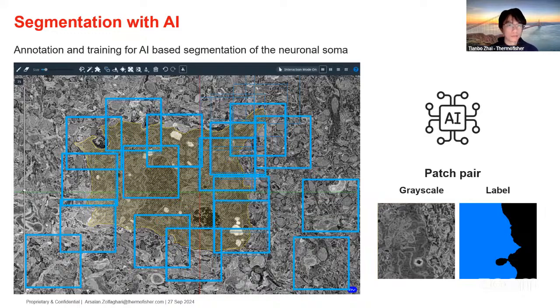Again, during the image analysis or segmentation in particular here, if you could try to view it down to the pixel or voxel level, then you will find many of the algorithms, or even the deep learning technique, make more sense. Going back to the prediction part of deep learning, we got a model, and we are able to extract such a model after we provide a small subset of our data set as learning material to the machine.